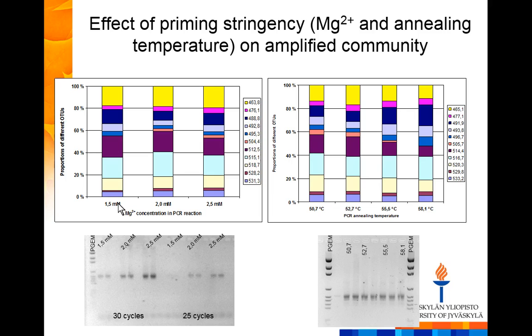So, back to the wet lab. Just remember that every single small choice that you make when you set up the PCR, or when somebody sets up the PCR, the amplification of the gene fragments for you, impacts the outcome.